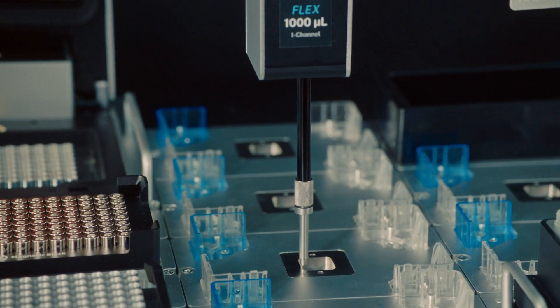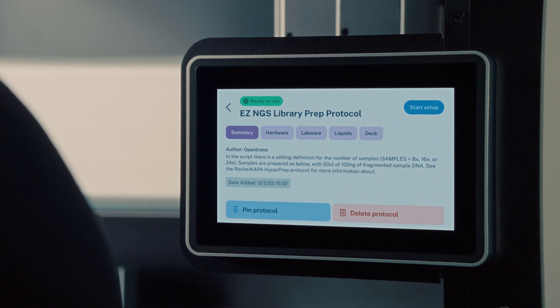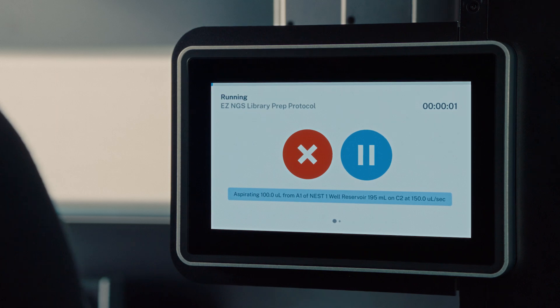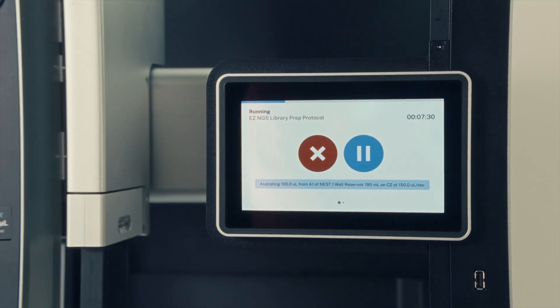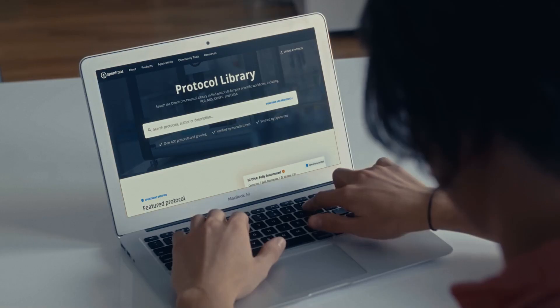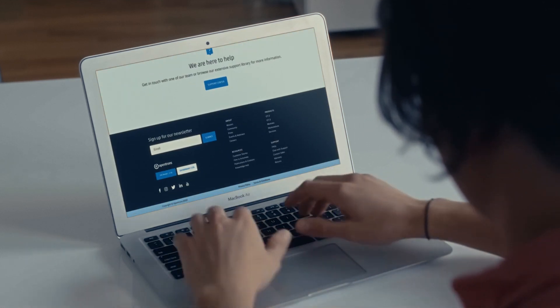The on-device display of the Opentrons Flex really provides a place to store common protocols that you run in your lab and it gives some prompts for really easy setup of labware, modules, and pipettes for your particular protocol. There are many different ways that you can create or download protocols for the Opentrons Flex. We have a protocol library where you can search through different protocols that have been created by users and by our team here at Opentrons.